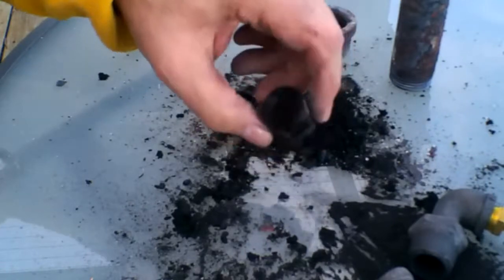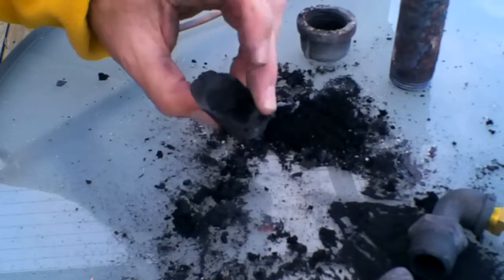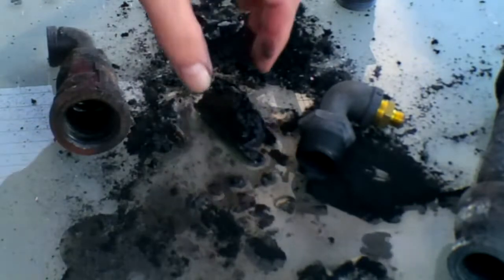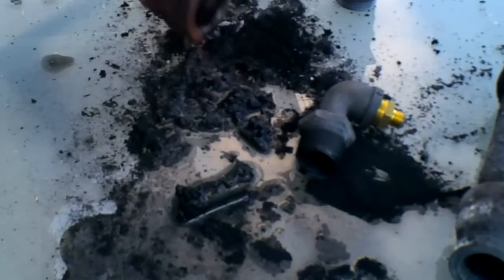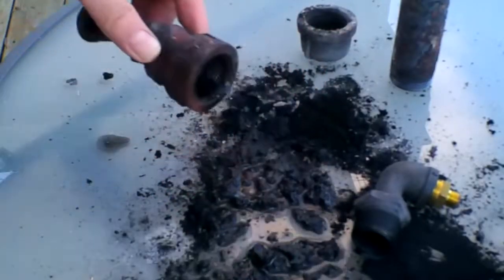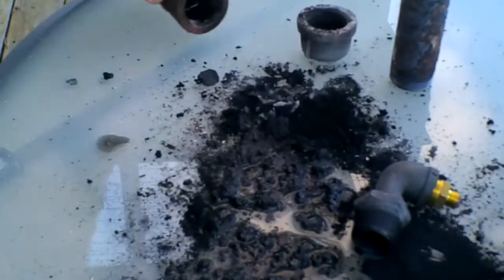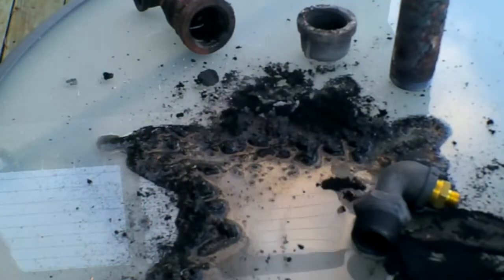One thing we will do is put some water on all this, just in case, because potassium does have a particular affinity for water. Not in a good way. It's very reactive with water. Aha! There's potassium in there. Look at that. Damn! Actually, that was a potassium reaction. I can't see it, but I can hear it.